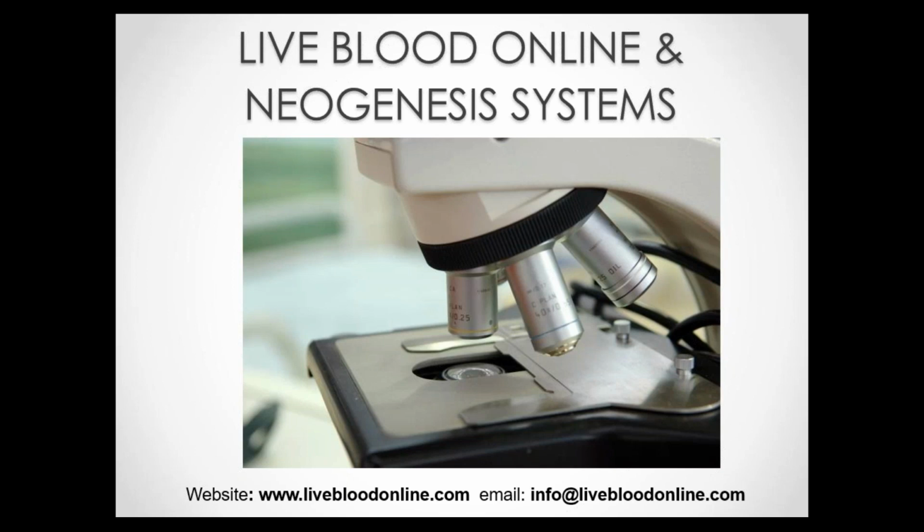Now, by assessing the changes taking place after implementing specific treatment protocols, we can establish whether a specific treatment protocol is actually working or not, and we can then make the necessary adjustments at a much earlier stage than would have been possible without blood analysis.